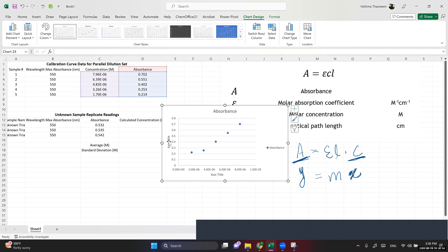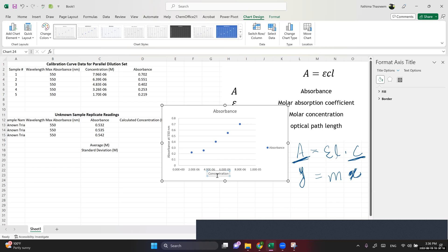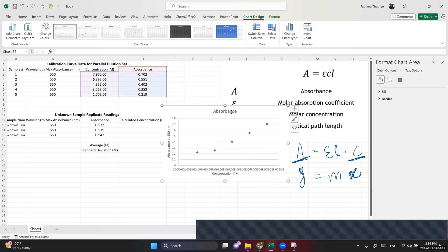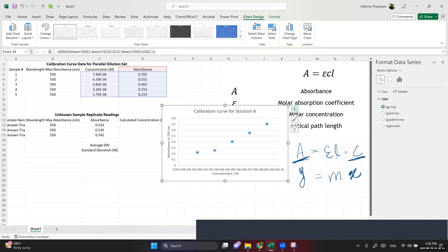I choose to add axis titles. I label the y-axis 'Absorbance at 550 nanometers' — absorbance doesn't have any units. For the x-axis I label concentration in molarity. I also put a meaningful title for the calibration curve, such as the name of your solution — for example, food dye or whatever your solution is.